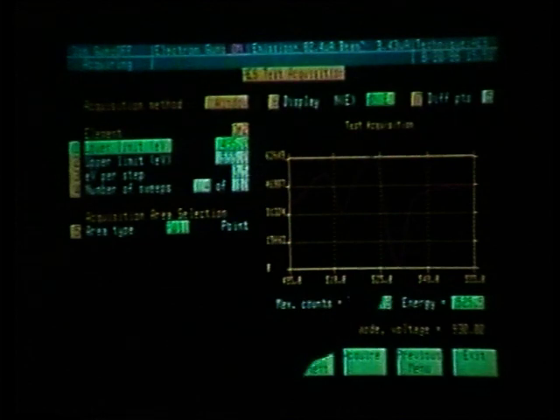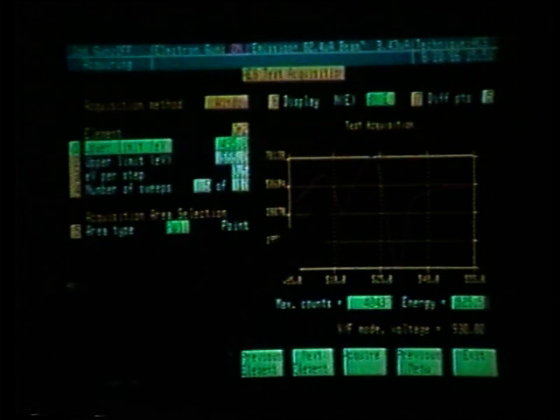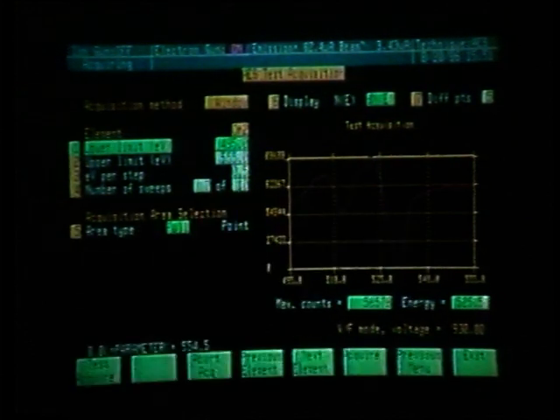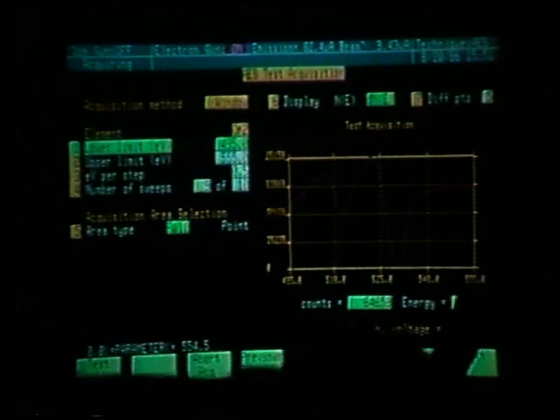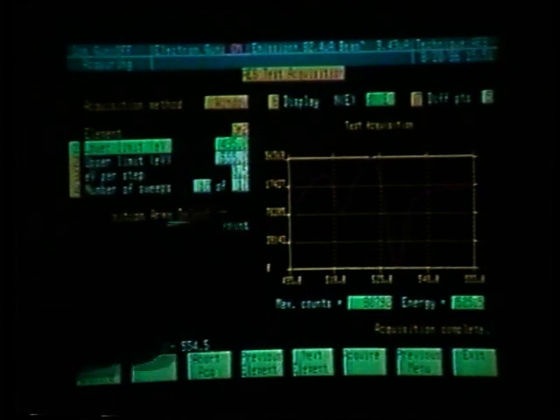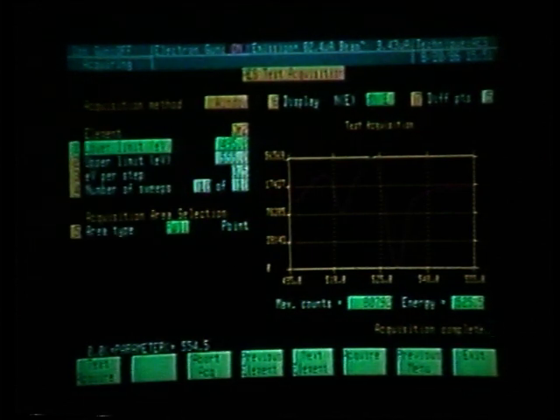Once again, we can easily see the chromium peak. We also see the oxygen peak, but it will not influence the peak-to-peak height of chromium. So we can leave the window once again at the width we have it, with a lower limit of 495 and an upper limit of 555.